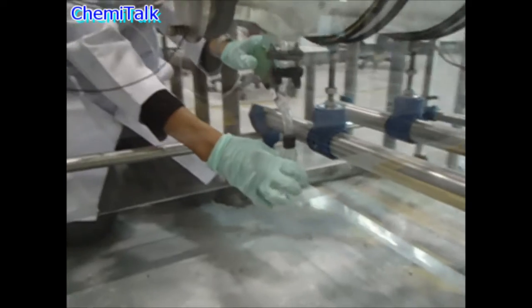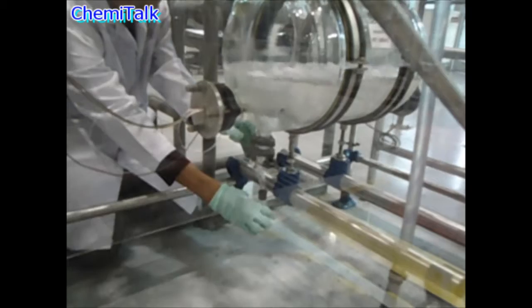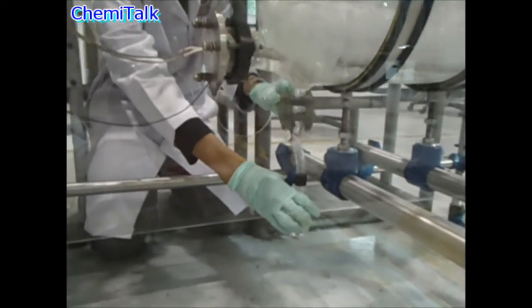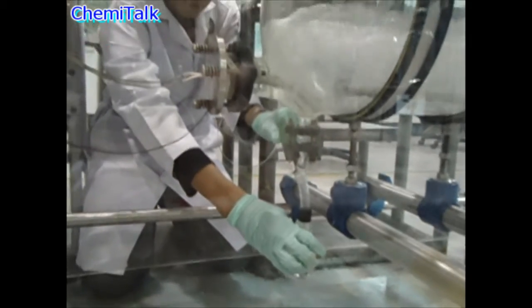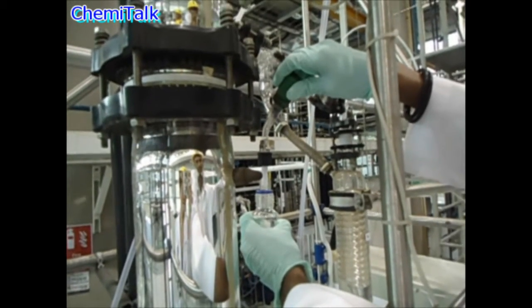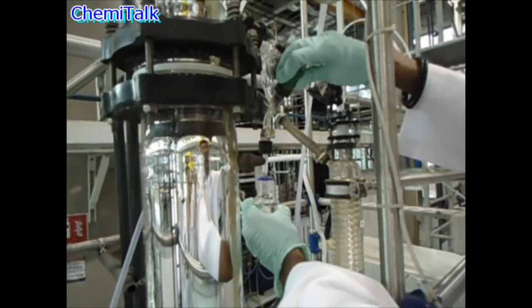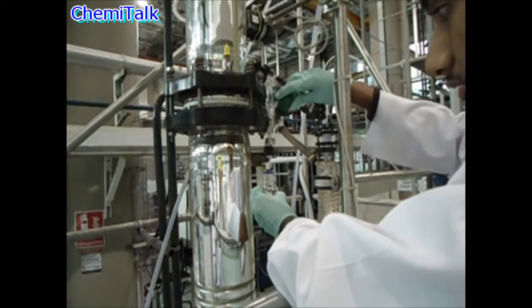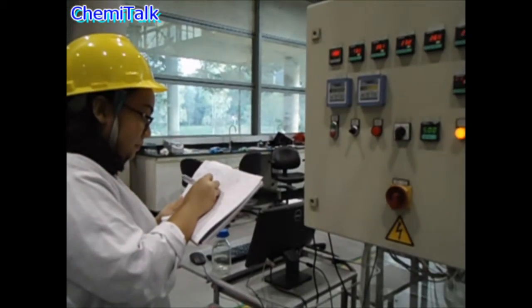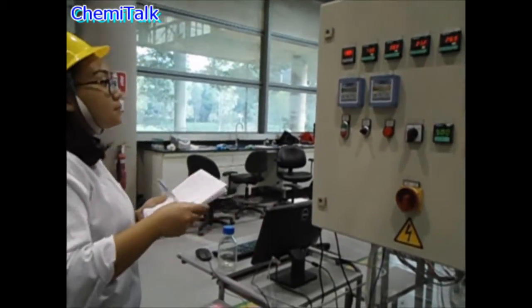After distillation has taken place for a time interval of 15 minutes, samples from the bottom product and distillate were collected. Over here, we can see how the bottom sample was collected. And over here, we can see how the distillate sample was collected. And then finally, the temperature for both the bottom and distillate product is recorded from the control panel shown here.